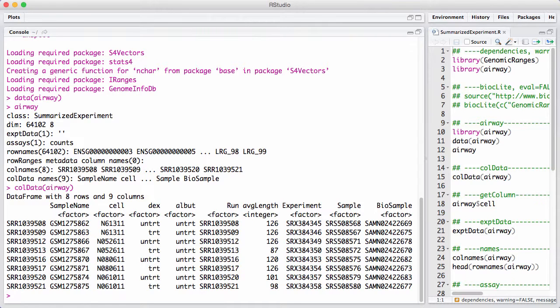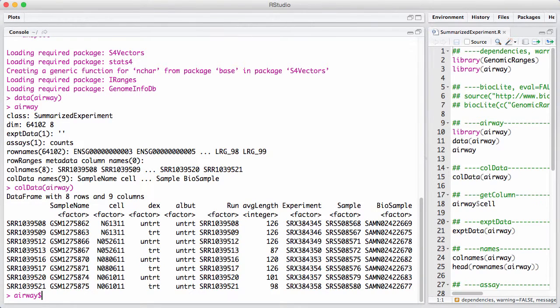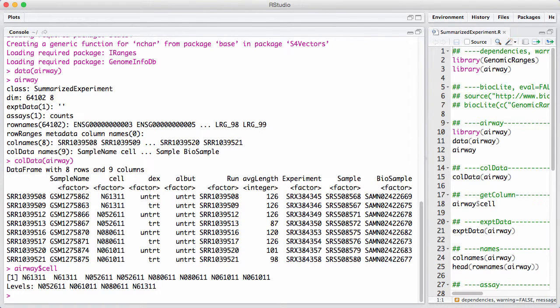As before, we can see that there are some sample identifiers and information about specific details of the experiment. We can get a column like in ExpressionSet by using the dollar operator. So we can say airway dollar cell and get back that specific column, which is highly useful.